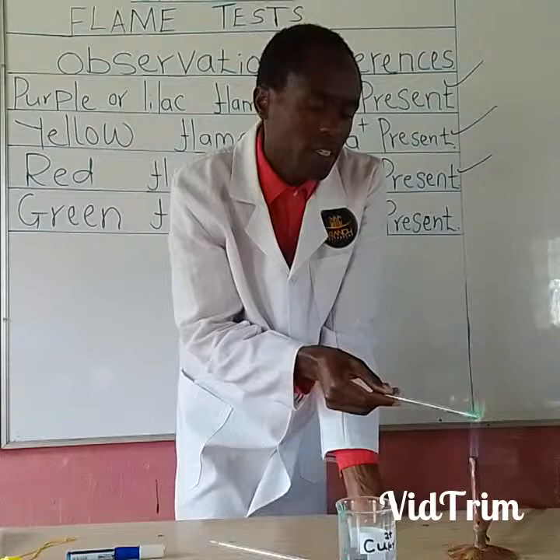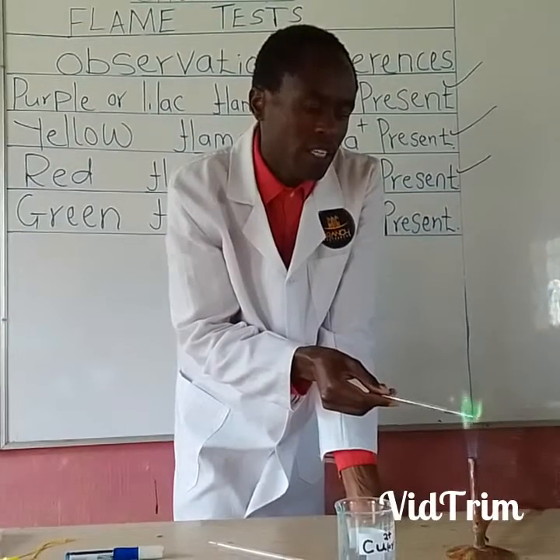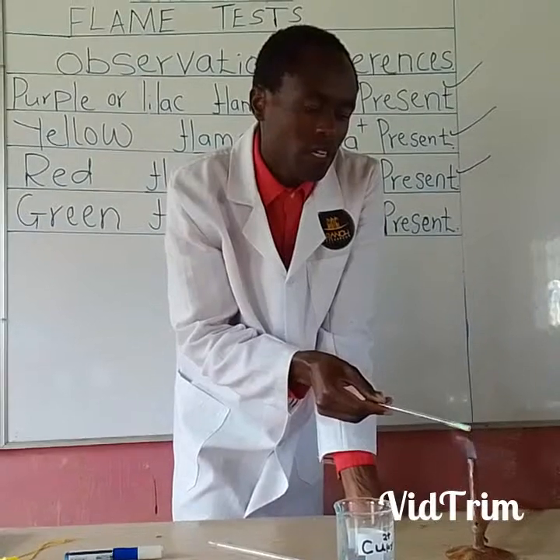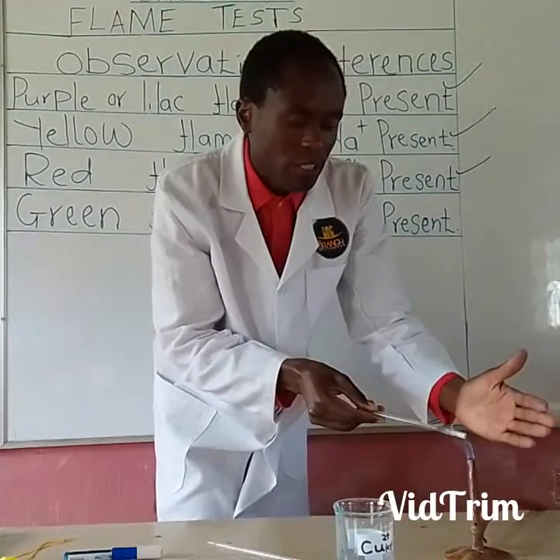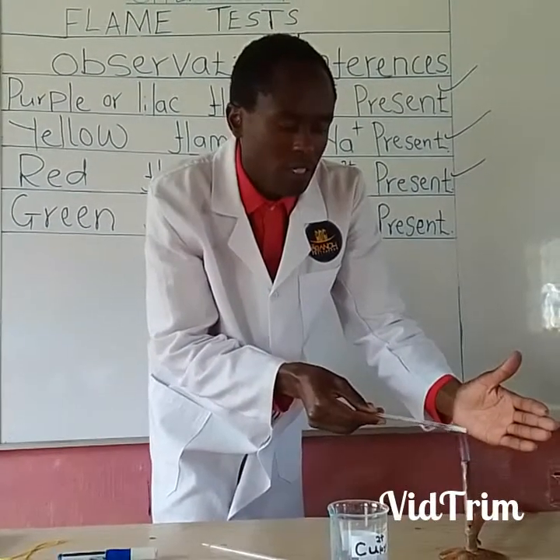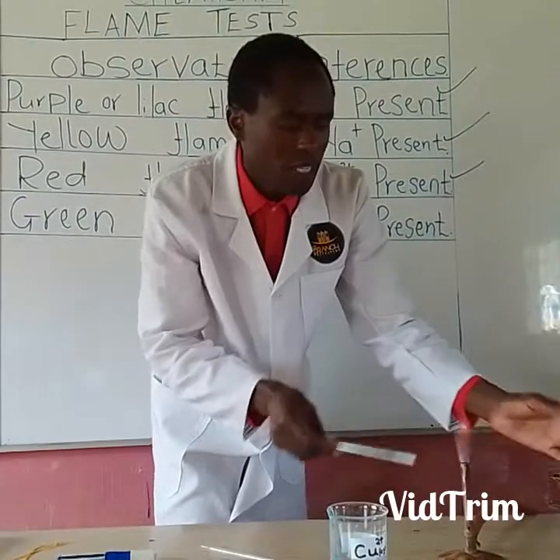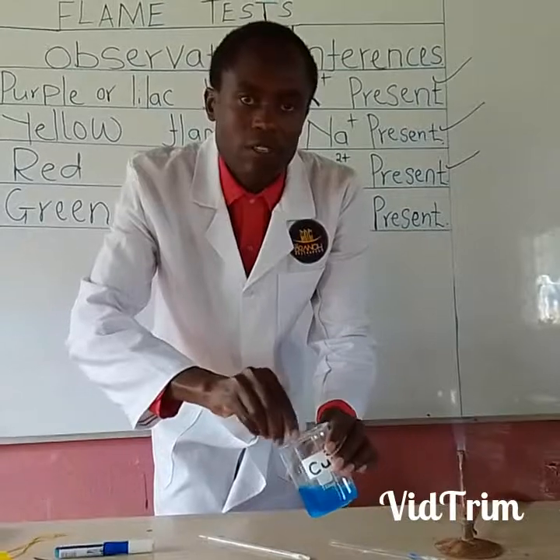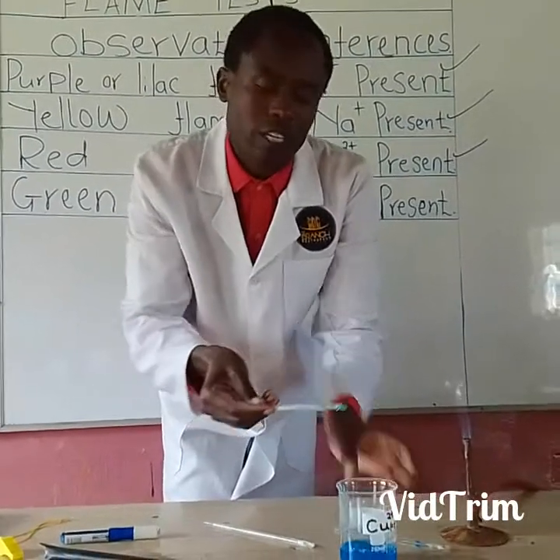Of course, you can see the green flame, indicating the presence of copper 2 ions. I can repeat it again with another glass rod, although you have already observed.